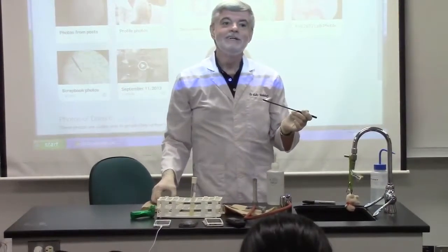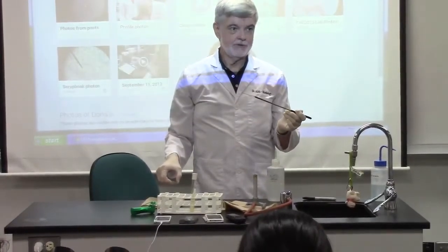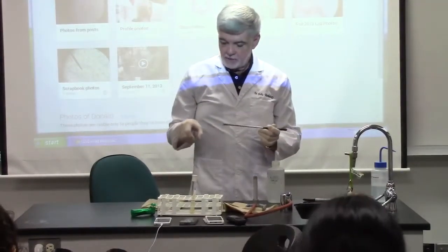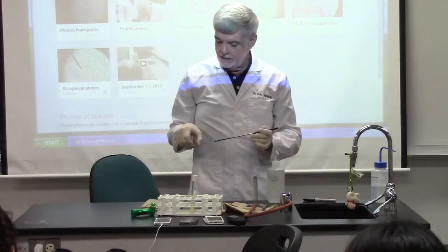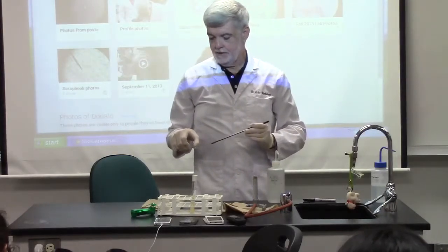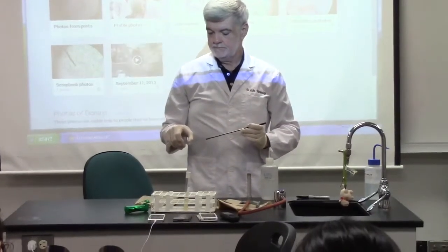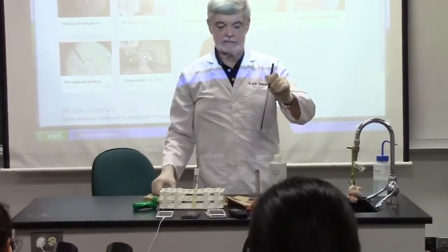Because people could have scooped off everything from it. I had people taking water that had nothing on it and staining it for 2 hours, and they were going, I can't see anything on my slide. Why have I not got anything on my slide? Because there's nothing on the tube. Okay, that slide wasn't really clean.